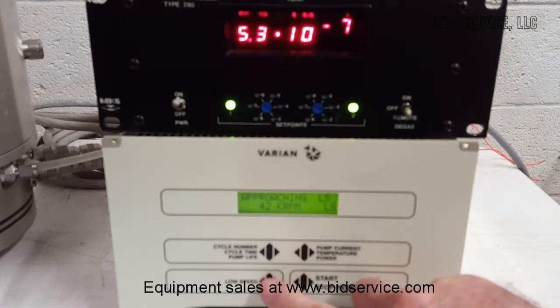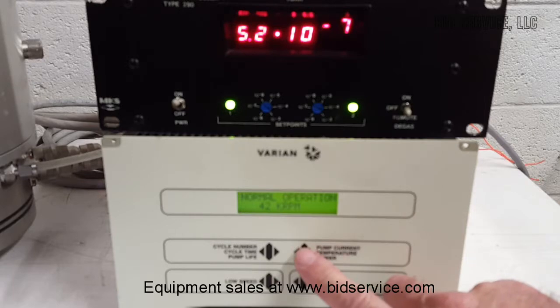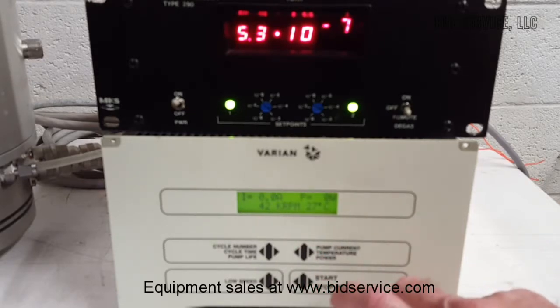It's pretty low speed on the display. Note the unit is water-cooled.